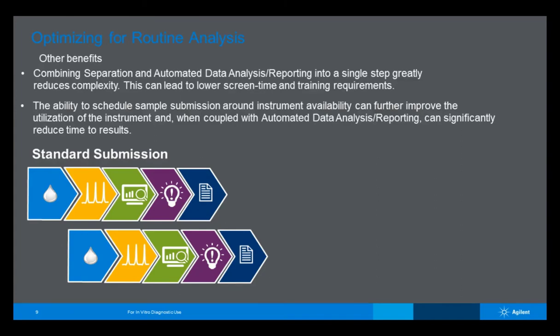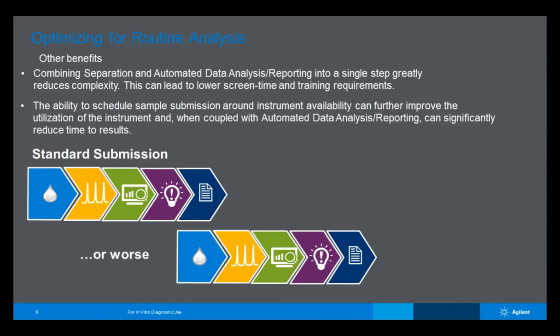And actually, this represents the best case scenario too. This is a situation where the individual on top would be able to do their data analysis, interpretation, and reporting offline. That's a very common workflow. We produce additional copies of the data analysis software so that people can do that.